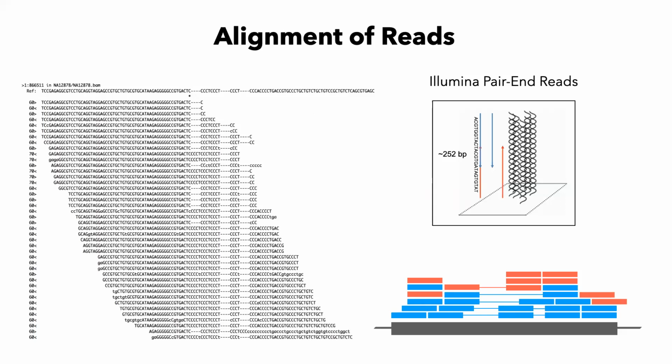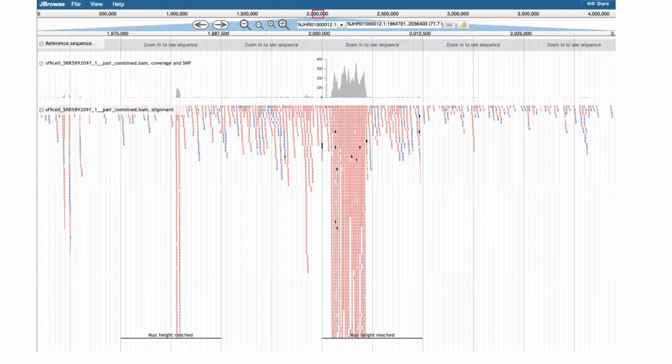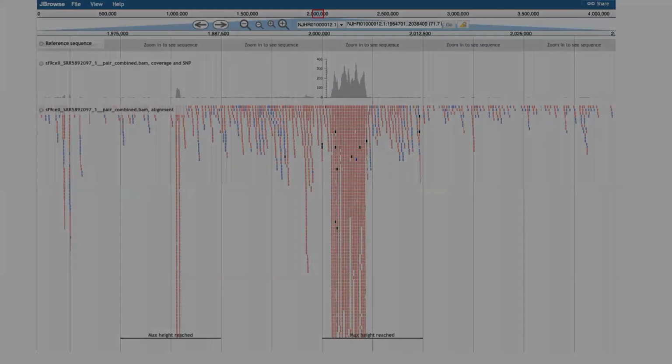So how can we know what are those alignments? Those alignments could be visualized. For example, we can use JBrowse or Integrated Genome Viewer or UGene. Some of these programs just provide us with an ability to see what is for each individual read and the alignment of the genome in terms of the BAM and the SAM files. Okay, so what do they look like when we visualize them? They look like this. Okay, so do all of you have access to the server platform, right?